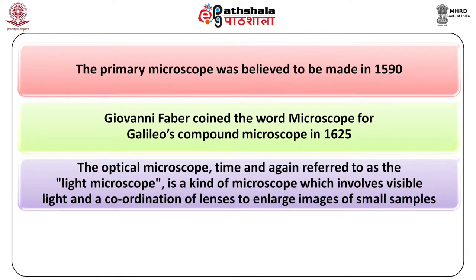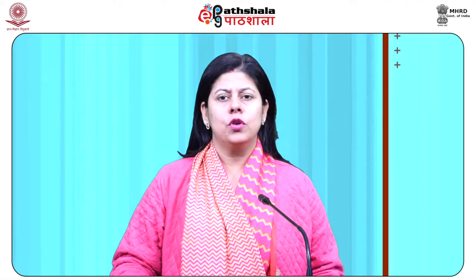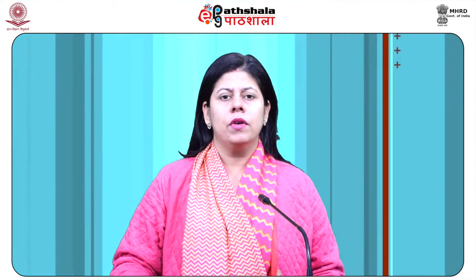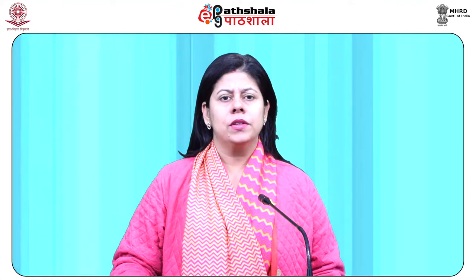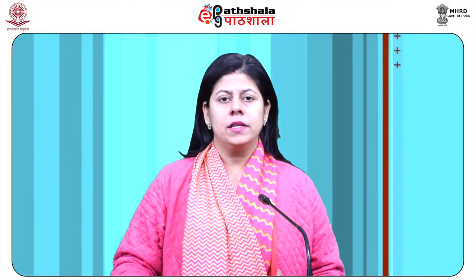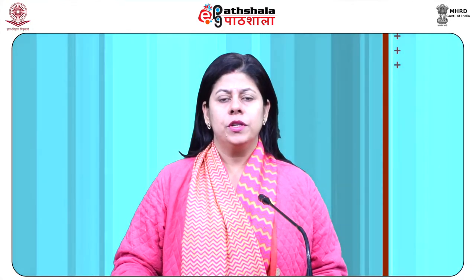The optical microscope, often referred to as the light microscope, is a kind of microscope which involves visible light and a coordination of lenses to enlarge images of small samples. Optical microscopes are the elementary design of microscope and were designed around 1600. Elementary optical microscopes can be very simple, although there are countless multifaceted designs with intentions to advance resolution and sample contrast. Optical microscopes were easy to improve and are prevalent because they use visible light. As a result, the sample can be easily observed by eye. The image from an optical microscope can be taken by standard light-sensitive cameras to produce a micrograph.